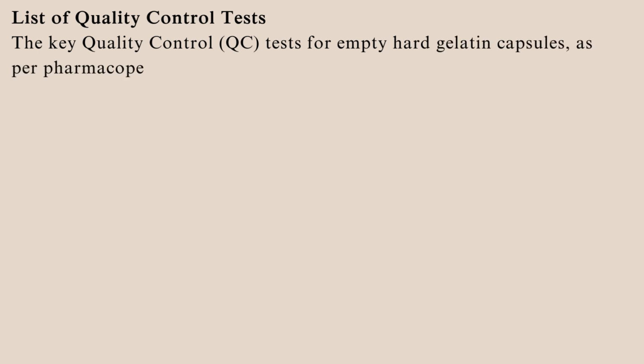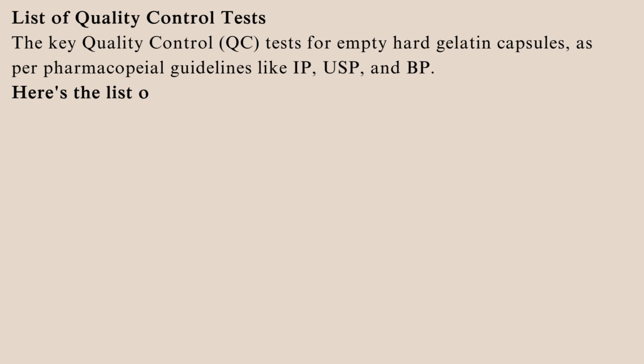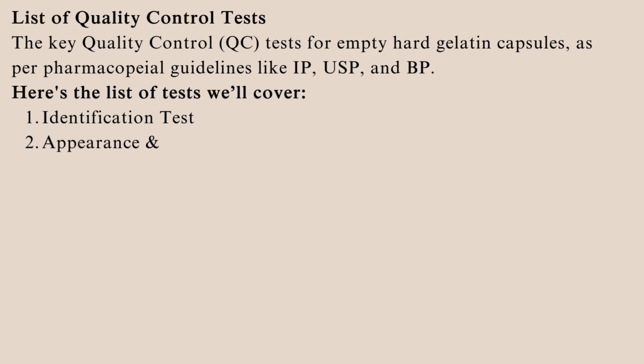List of quality control tests. The key quality control (QC) tests for empty hard gelatin capsules, as per pharmacopeial guidelines like IP, USP, and BP. Here's the list of tests we'll cover. 1. Identification test. 2. Appearance color. 3. Dimensions, size and thickness. 4. Moisture content. 5. Disintegration test.